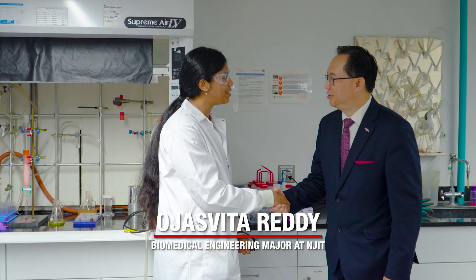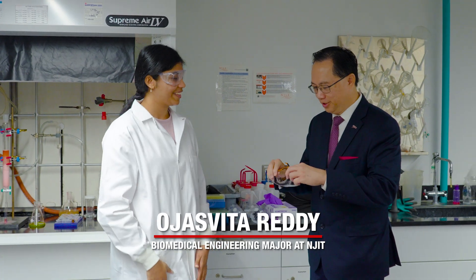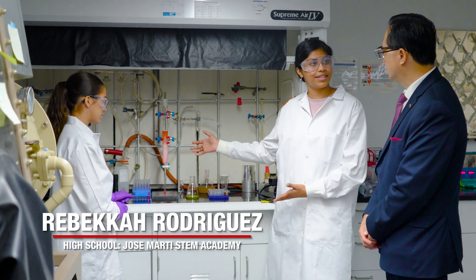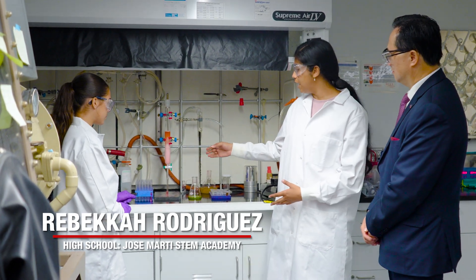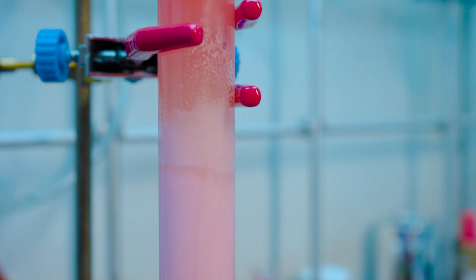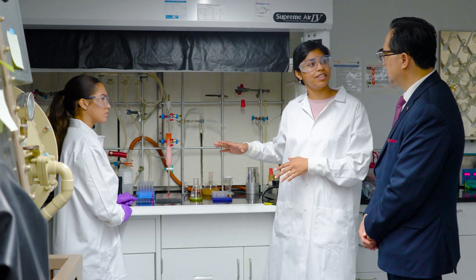Hello, President Lin. I'm OJ Shwita, but you can call me OJ. Nice to meet you. Here are some safety glasses — safety first. Safety is very important at NJIT. Liquid chromatography is a procedure we use to separate our mixture and purify the compound we synthesize. When we create our compound, we use a column — as you can see here — to load up first our silica gel as the first layer. On top of that, we add our dissolved compound, and after that, we add a little sand to settle all the layers and make sure everything is in place.